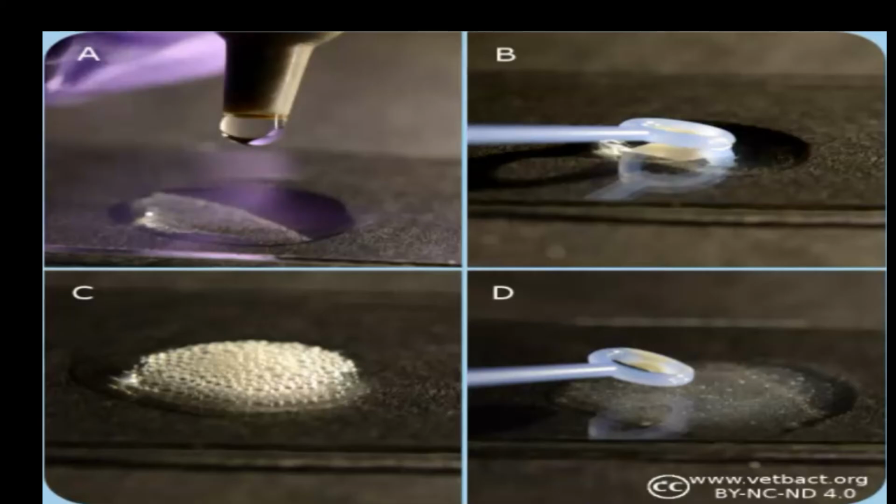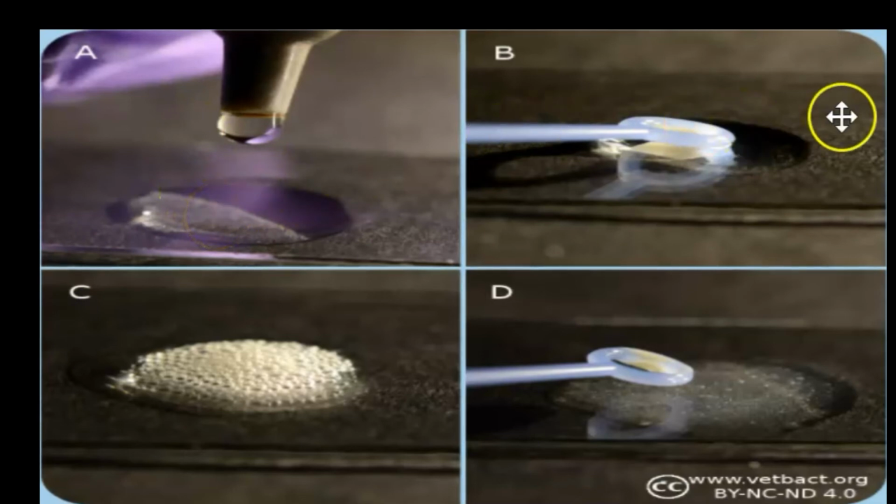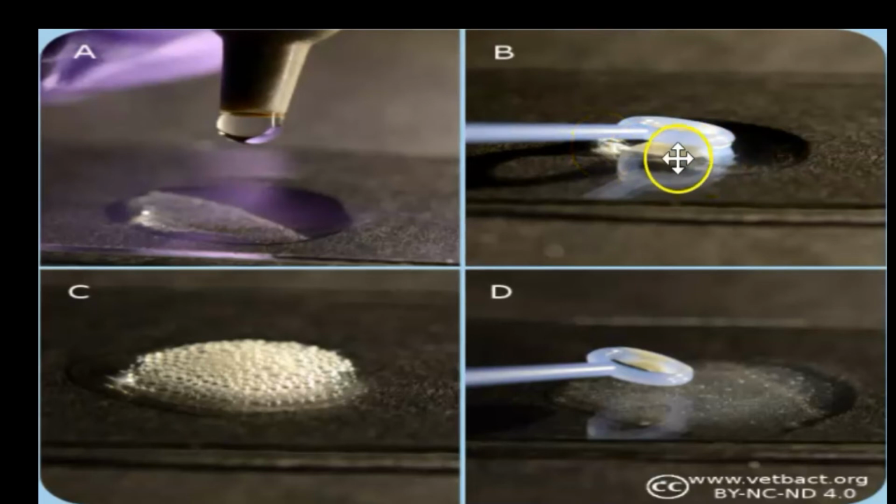Now let's see the procedure of catalase test in pictorial view. Apply 1 drop of 3% hydrogen peroxide on the slide. Transfer bacteria with a plastic loop to the hydrogen peroxide solution.